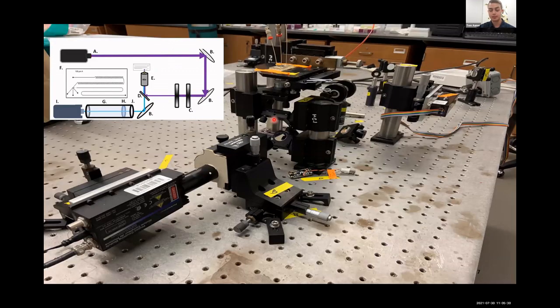And then here's a picture of the setup in the lab as it is today. So here we show our ultraviolet laser going to our sample, which is on our microfluidic chip, and then we have our fluorescent light that goes to our photodiode detector.